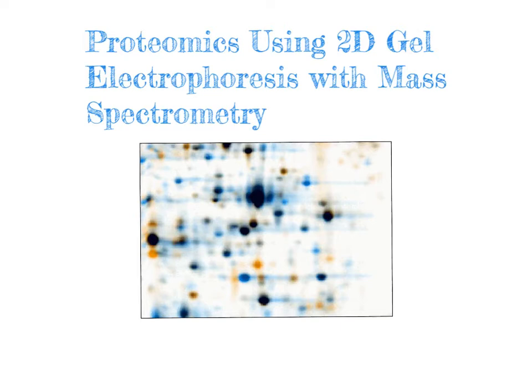Blue spots, such as here, and elsewhere, represent proteins that are only present or much stronger in the control sample. And then the black spots correspond to proteins that are present in both the treatment and the control sample.